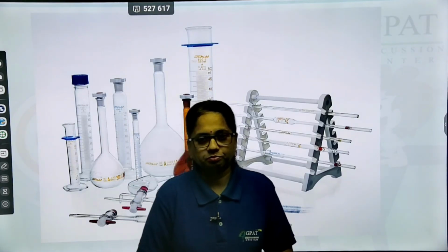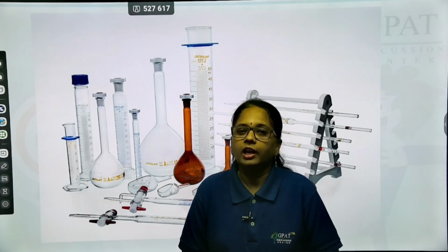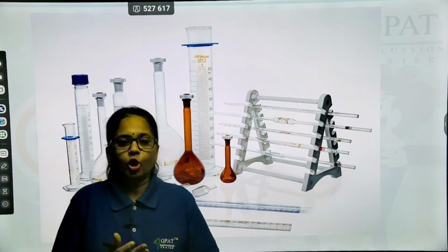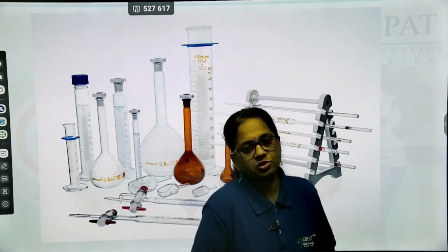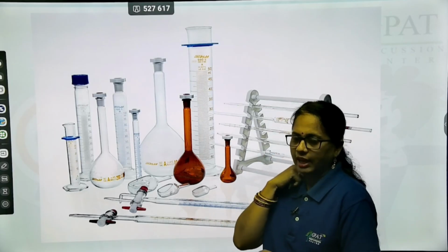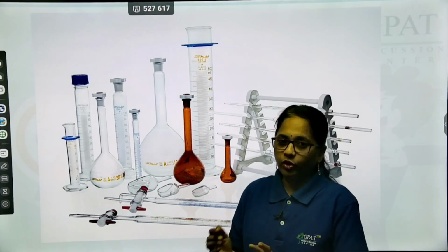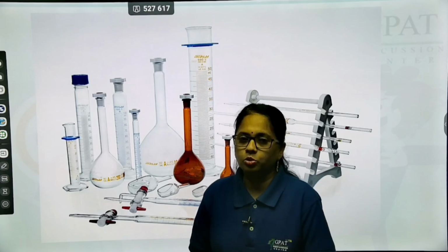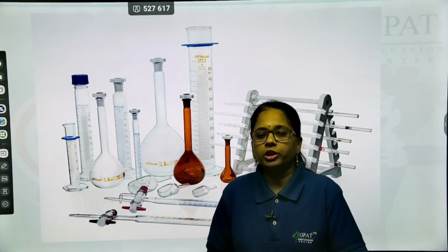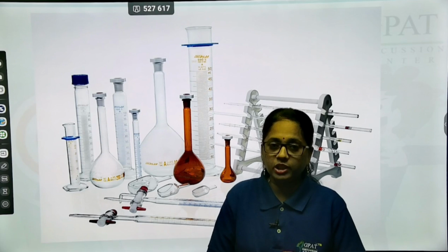Okay, generally in our laboratory glassware, whenever we are going to use, there are n number of glassware. Okay, like starting from the reagent bottles as well as normal sample containers, and so many equipments are also there, but we are talking only about the glassware made up of either type 1 or type 2 glass. Okay, so only those two are allowed in the laboratory experiments. So in that you are going to see two types. This type 1 glassware is generally the preferred one.